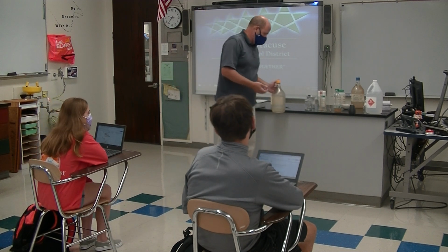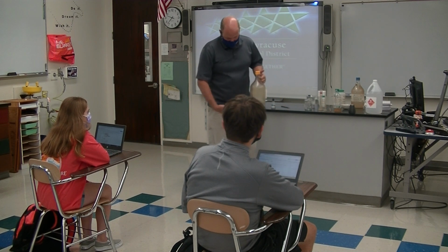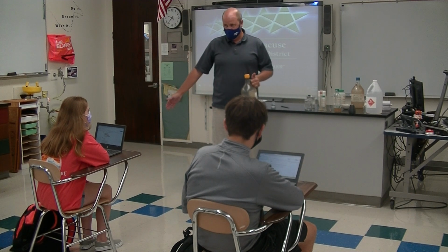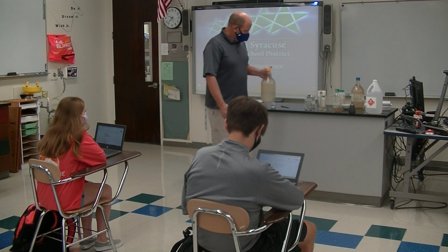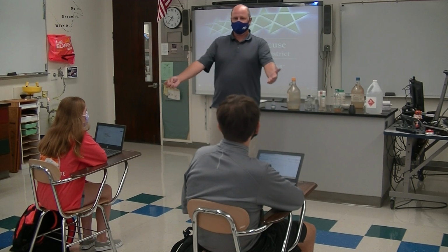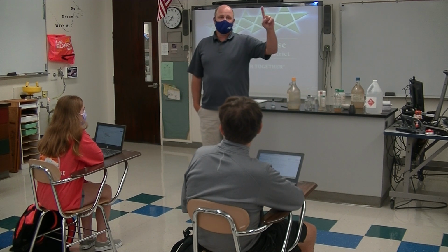She hit the bottom of the bottle on the counter, and then the bottom fell off and the acid went right down the front of her. Waist down, completely covered in acid. What does she got to do? You guys just learned. What do you got to do? Huh? Use the hose. Okay, before you use the hose. I'll remove the clothing. Remove the clothing. So she removed the clothing.